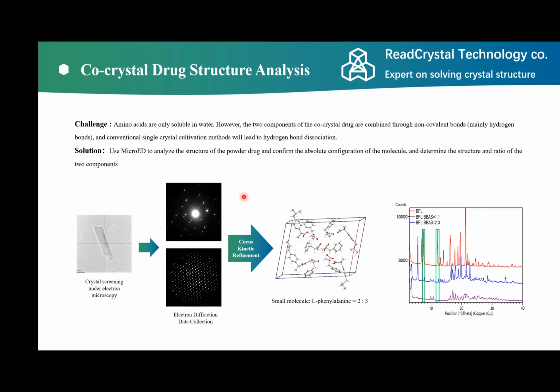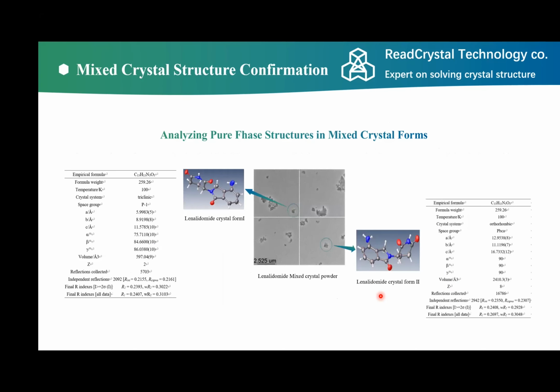So with micro-ED technology, we can quite straightforwardly collect data and solve the structure of co-crystals, and it's very helpful for pharmaceutical companies. With micro-ED, we can also determine the structure of each phase from a mixed phase sample.